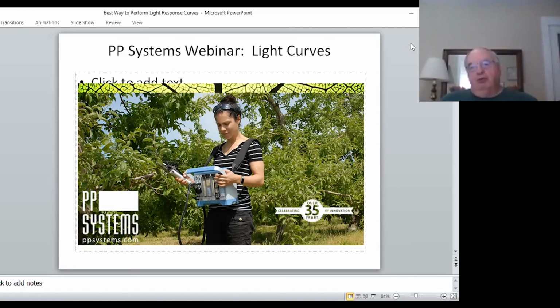So what you're looking for is a dark respiration rate that's representative of what it was doing when the light was on. So I wouldn't wait more than a few minutes for it to do what it's going to do. Okay. What light spectrum are you using for these graphs? These were all done with, I don't remember the percentages, but it's using the red, blue, green proportions that PP Systems recommends in their manual as being the closest simulation to sunlight.